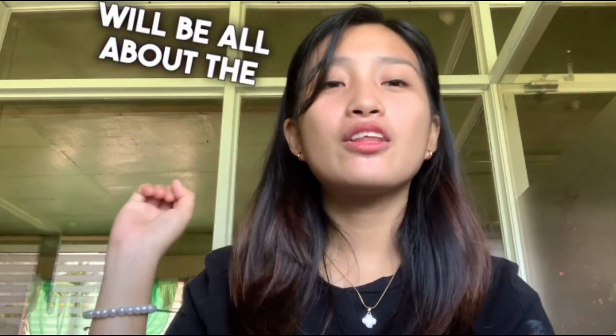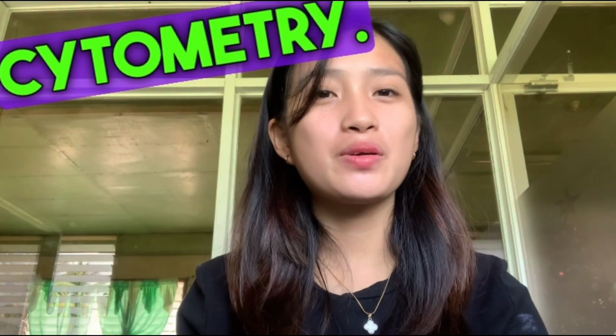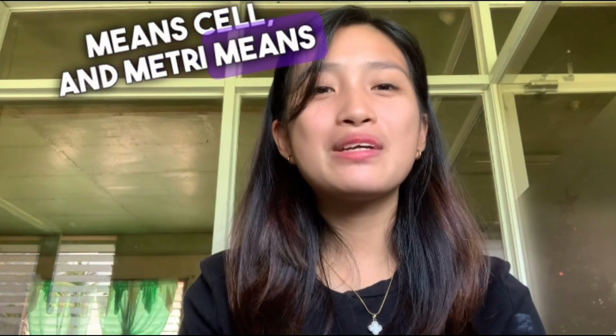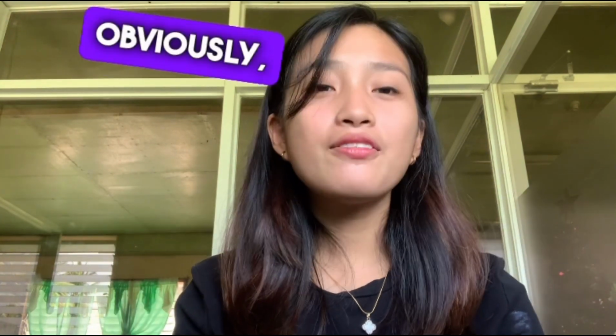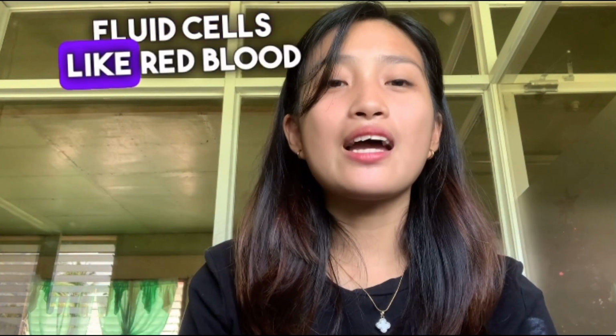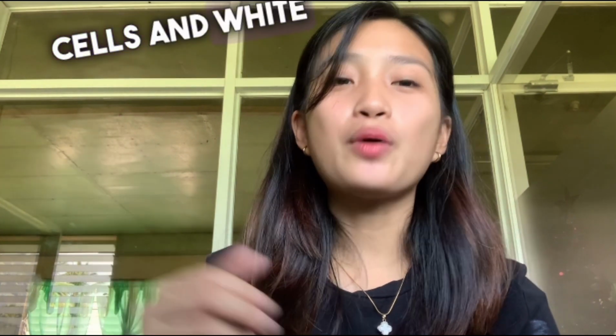Hello everyone, my name is Alvi Casisomoza and my topic will be all about the three systems of flow cytometry. Before anything else, let us define first what is flow cytometry. From the word itself, flow means fluid, cyto means cell, and metry means measurement. Obviously, flow cytometry means fluid cell measurement. Fluid cells like red blood cells and white blood cells.